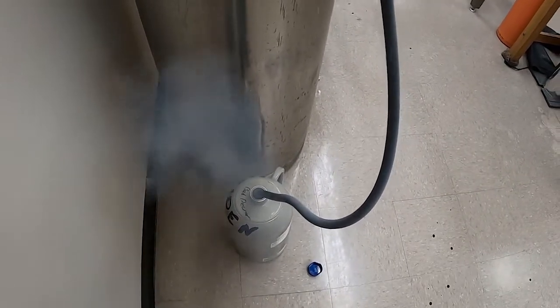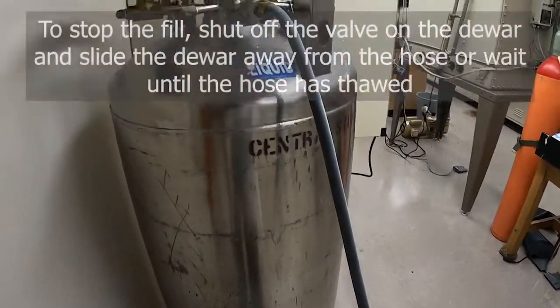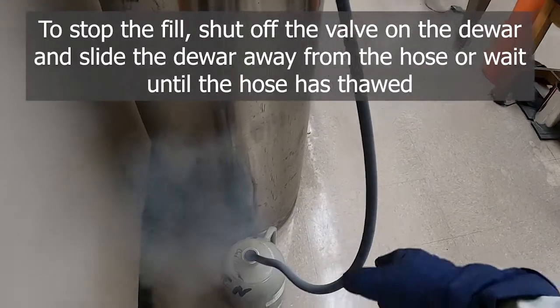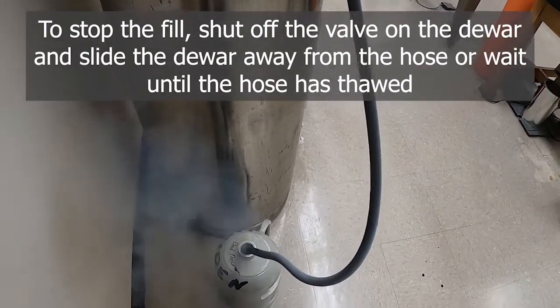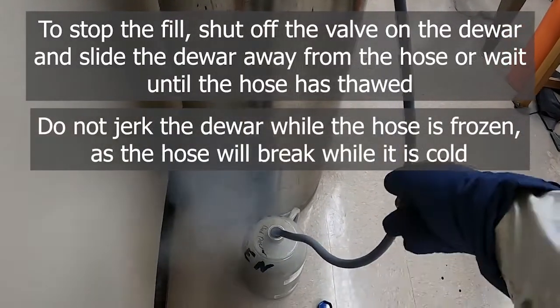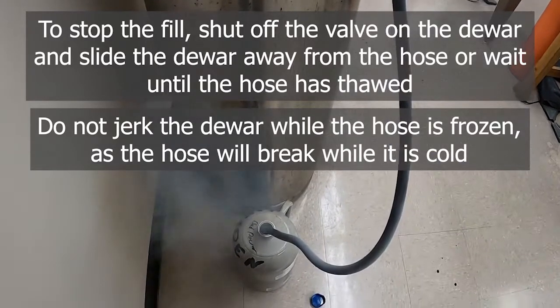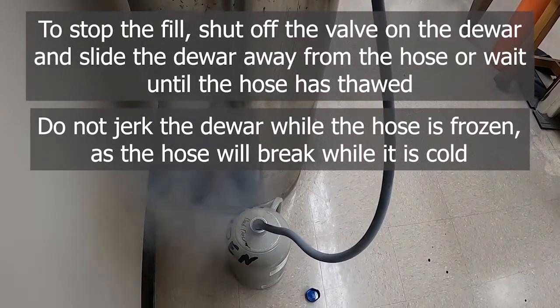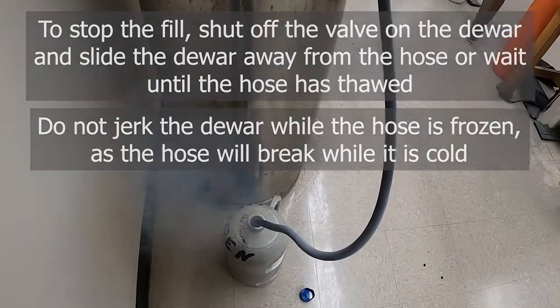To stop this, of course, we just shut off our liquid nitrogen there at the top. And then the hose is going to be stiff, so kind of work your way out of it if you can. And if you can't, you'll have to wait until the hose is flexible again, kind of warms up, and then you can remove it. Cap your dewar and you're good to go.